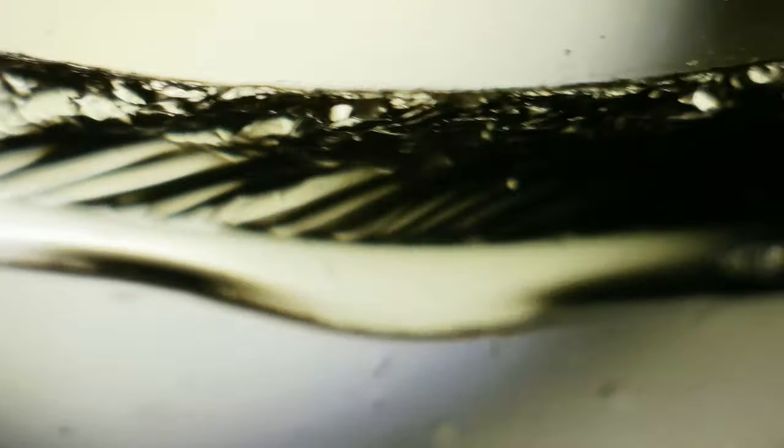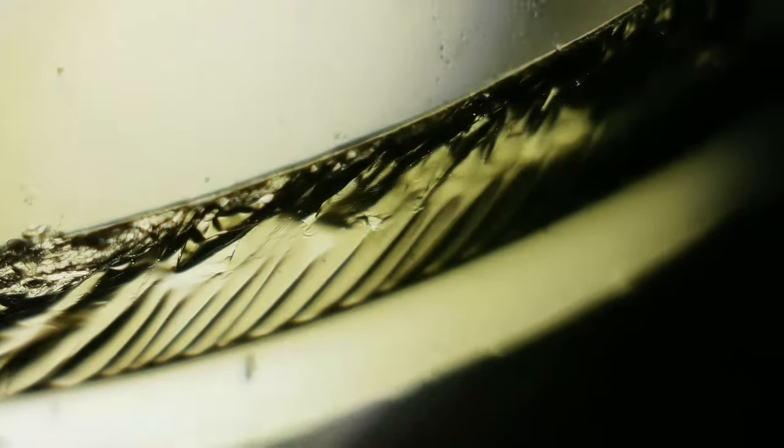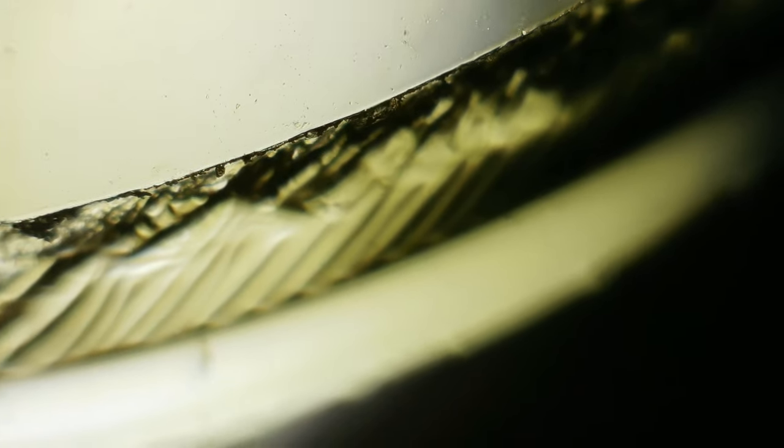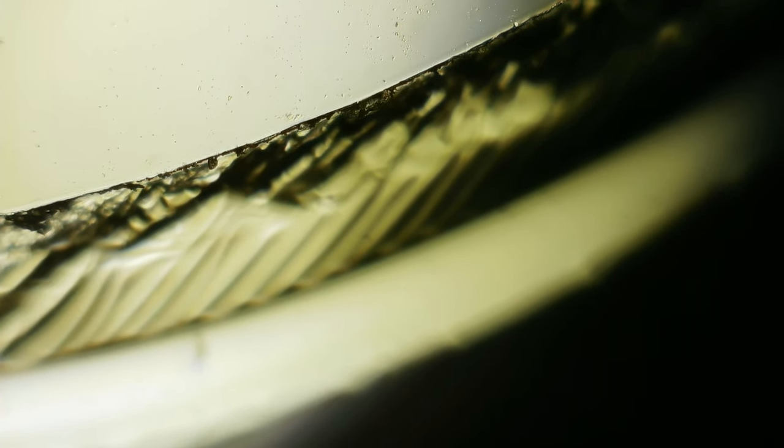All right, this is a honeybee wing. Look at that — that is just amazing. That lens really gets in there. That's super impressive.